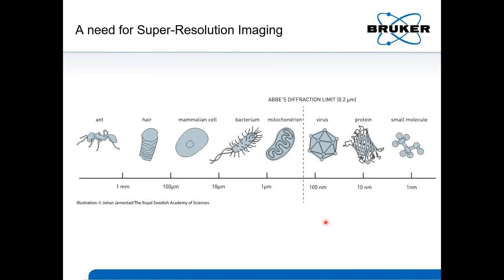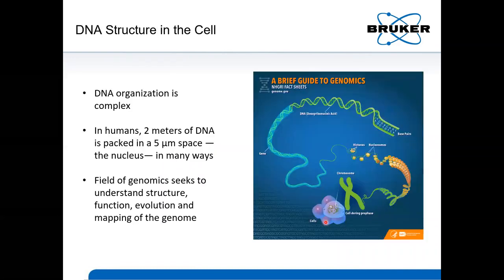To be able to visualize structures well below the diffraction limit using light microscopy, a variety of super resolution techniques have been developed. One such method, which will be the focus of today's talk, is single molecule localization microscopy. In recent years, single molecule localization microscopy has gained a lot of traction in the field of genomics, which focuses on understanding the complex organization of DNA.